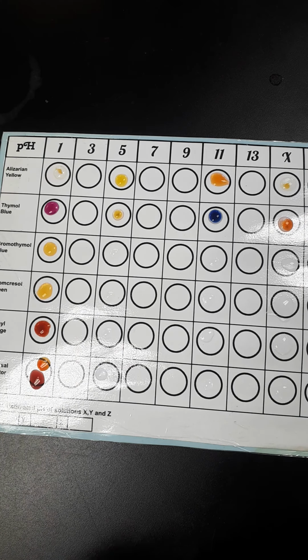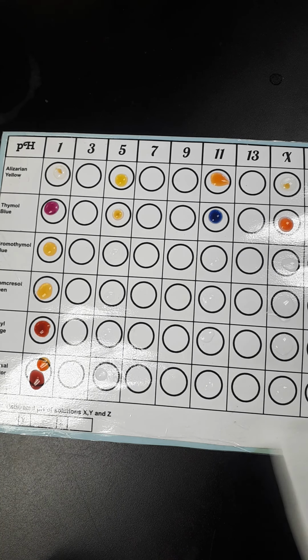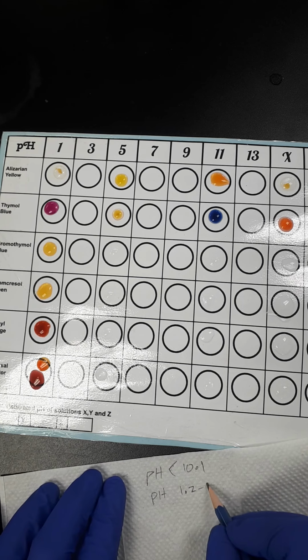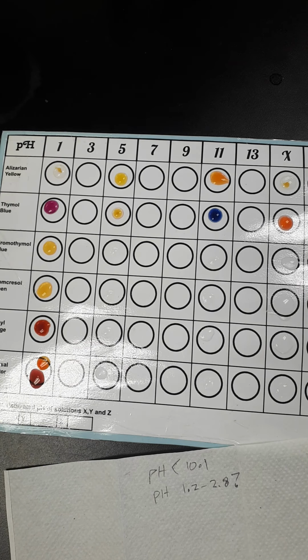So our unknown looks like, I honestly can't tell, it looks kind of orange to me. So I'm going to write that down as orange. I'm going to put a question mark next to it because remember, you're talking to the colorblind guy here. So pH 1.2 to 2.8, and then just put a little question mark by it.